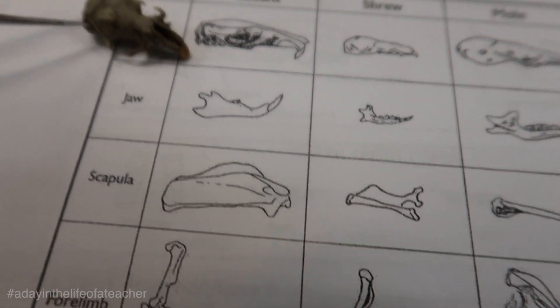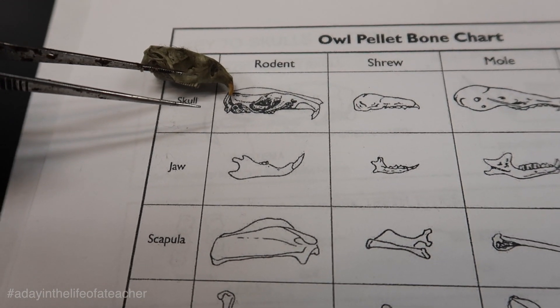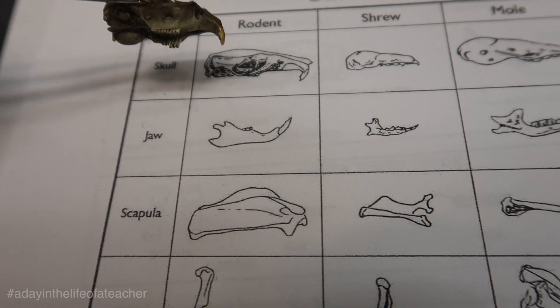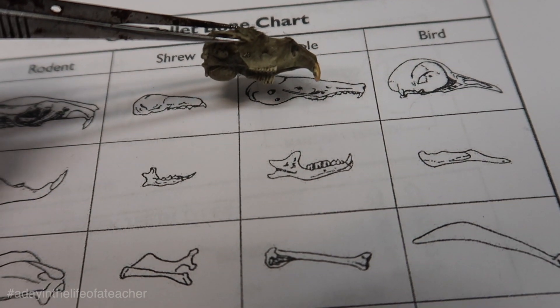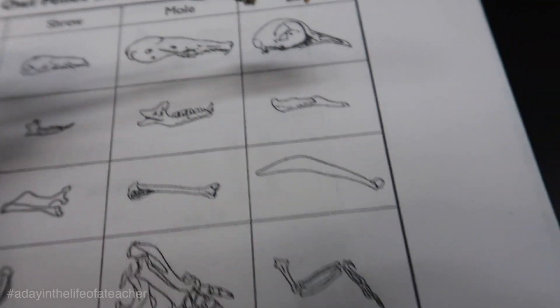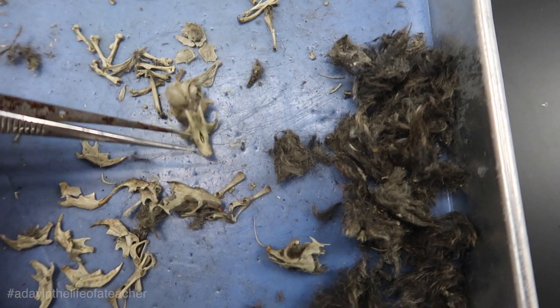If you look at this skull a little bit closer and turn it to the side, you should see that this is a rodent. You can easily identify it as a rodent by looking at the front teeth — see how the teeth are too long here. So it's not a shrew; the mole maybe, but the teeth don't ideally match up the way they do for the rodent. This group in particular had four rodents.